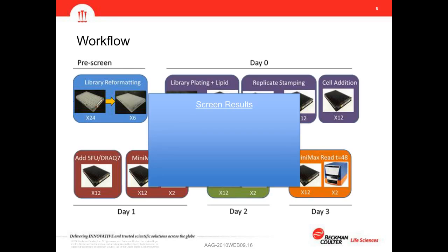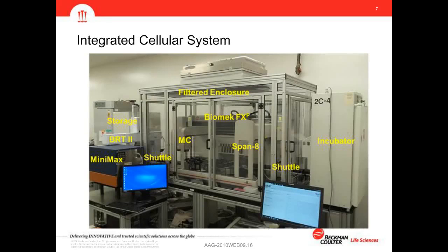So to give you an idea of what this all translates to from a data perspective, obviously we started with 6 384-well library plates, 384 wells each, with 2 replicate assay plates for each well, 2 wavelengths that we were analyzing at 3 different time points, for a grand total of 27,648 data points simply coming off the analyzer, and that needs to be mapped back to our library. And this doesn't take into account other pieces of data that we'll be describing as we go through the talk.